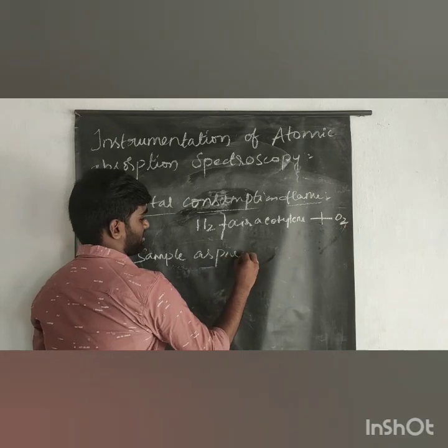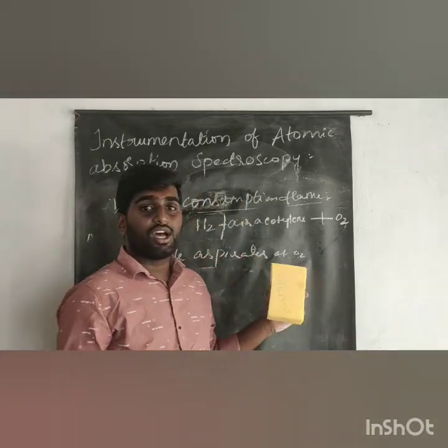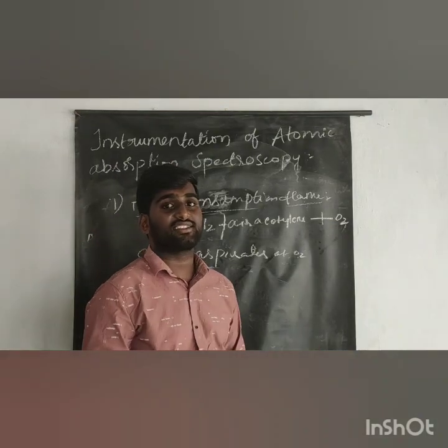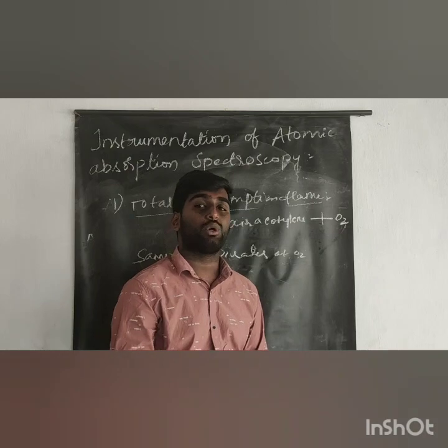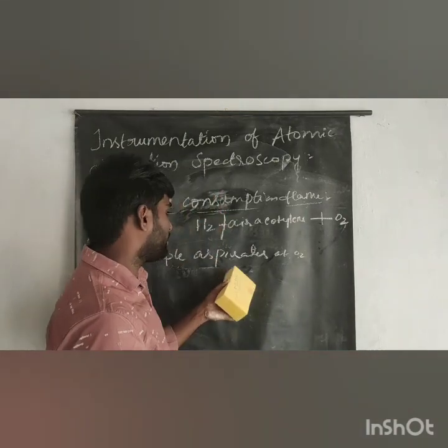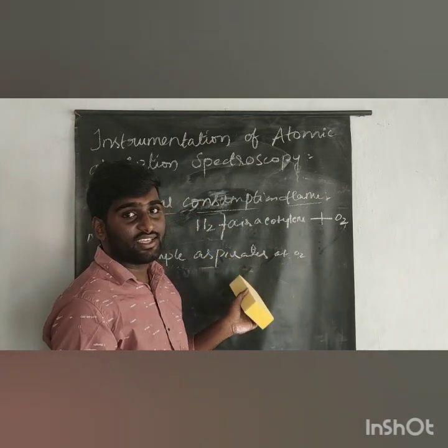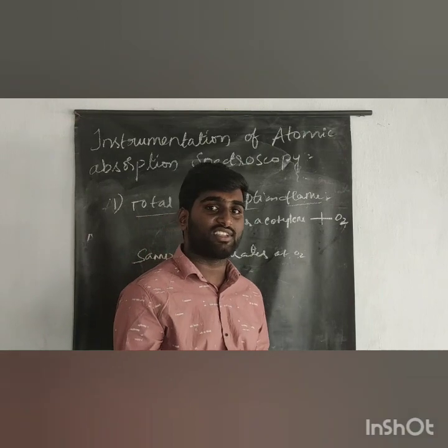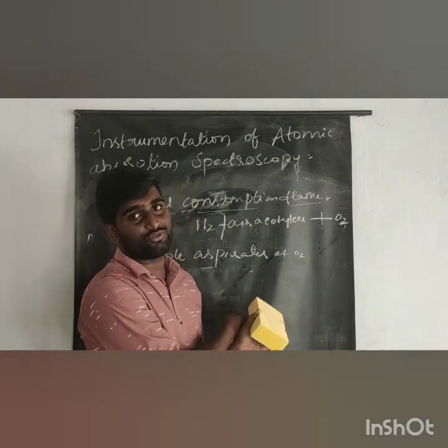Okay, next point. Here the sample is aspirated at oxygen. After aspirating with the oxygen, it leaves the solid residue, and then further it proceeds to the emission or absorption, or goes to the atomizers. Next, this is the best-used flame because here the sample is used regardless of droplet size. Without the need for droplet size, we can use this sample in any form here. So here, it is used regardless of droplet size of sample.